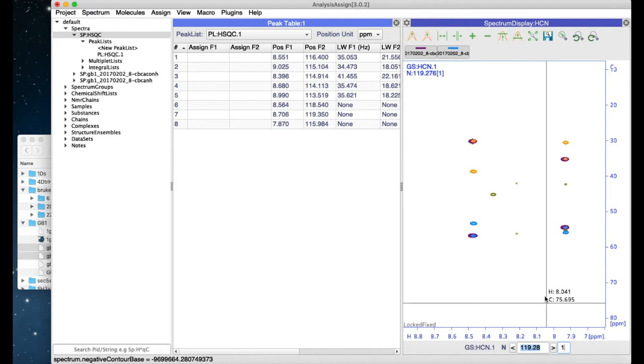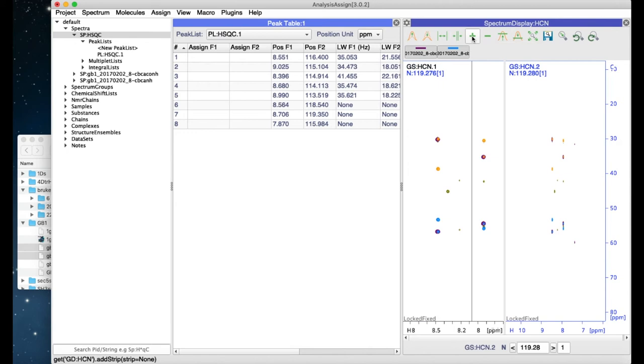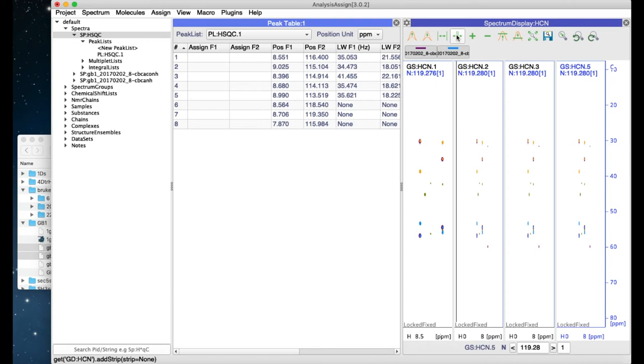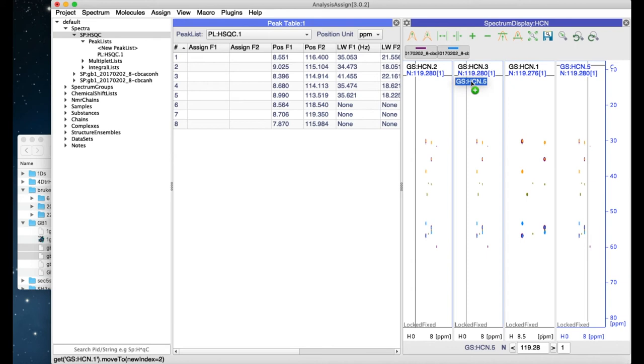I can add strips to my 3D spectrum or to any spectrum indeed by clicking on the large plus symbol up here or remove them again with minus. These buttons here on the left allow you to increase or decrease the width of your strips. You can also drag strips in order to change their order.